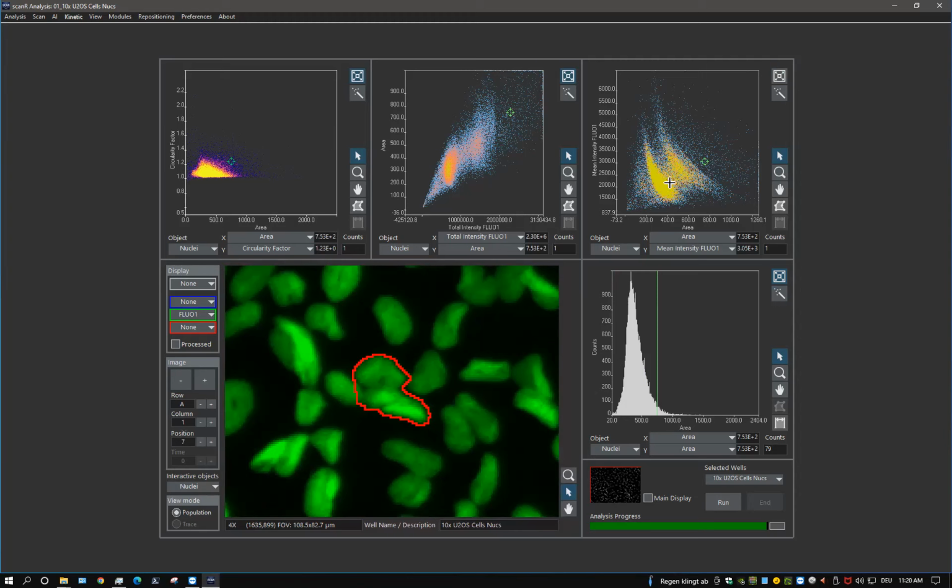So I can do a decent analysis here. But I needed to adapt it carefully to the data. And if I would work on the next scan, I would have to readapt. So let's try another approach. I now open a TruAI assay.